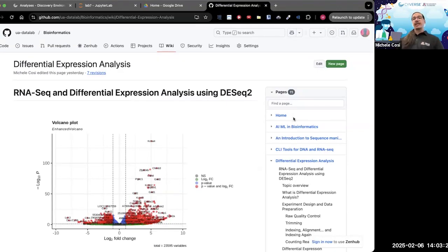We're going to be continuing to work with the data that we worked with last week. And we are going to bring in, I think, 3 more controls and 4 different experiment type data.